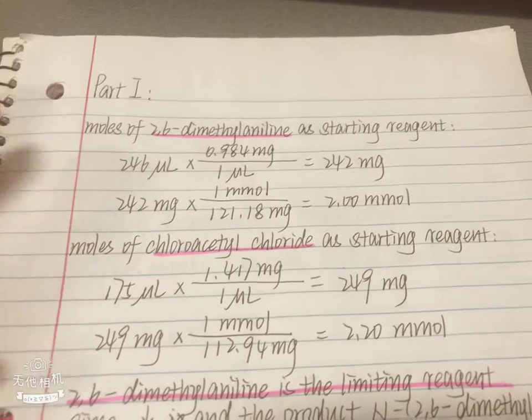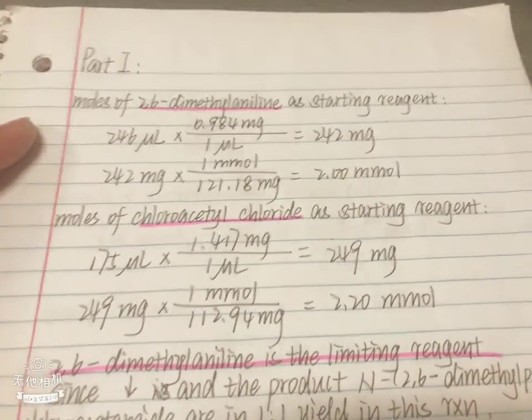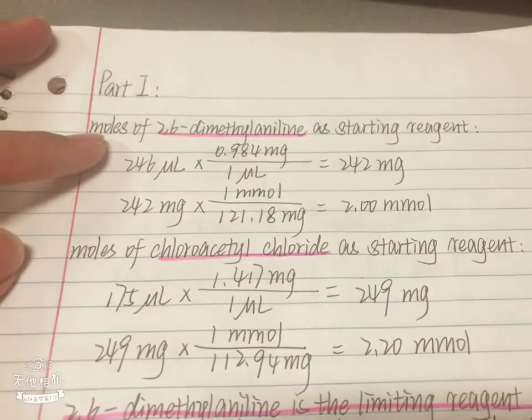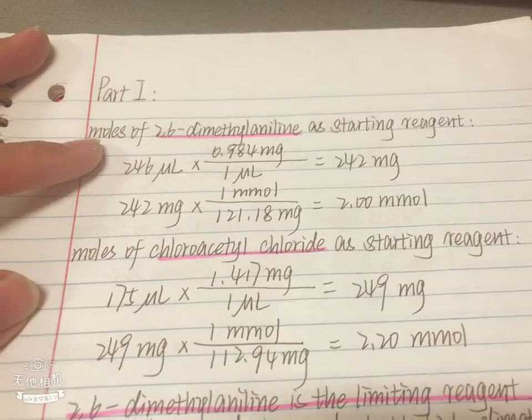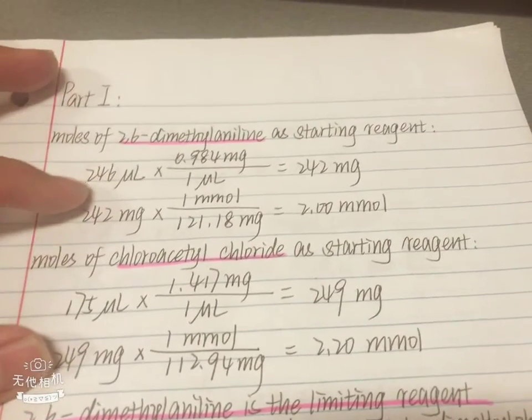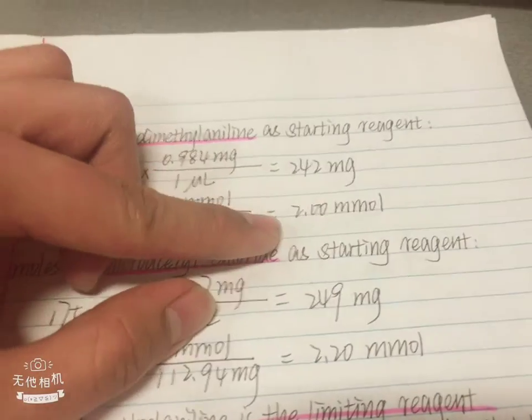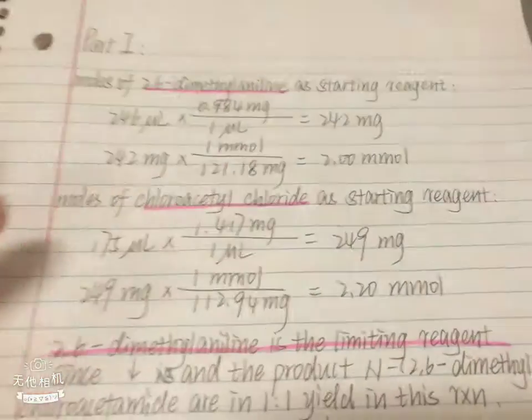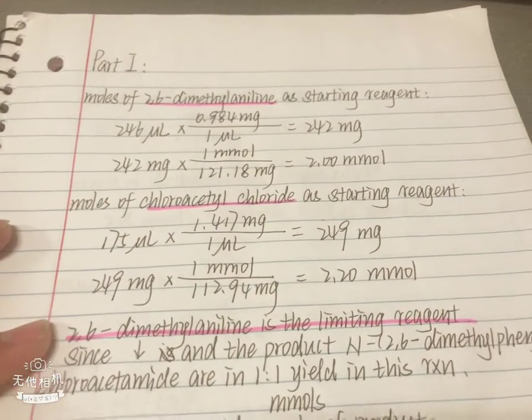Then I also measured 175 microliters of the chloroacetyl chloride, and so far we have collected all the starting materials. Before proceeding to the next step, I would like to determine the limiting reagent. We have two starting reagents, 2,6-dimethylaniline and chloroacetyl chloride. After calculation, I found the first one has a lower amount of millimoles compared to the 2.20 millimoles. So we can say the 2,6-dimethylaniline is the limiting reagent.